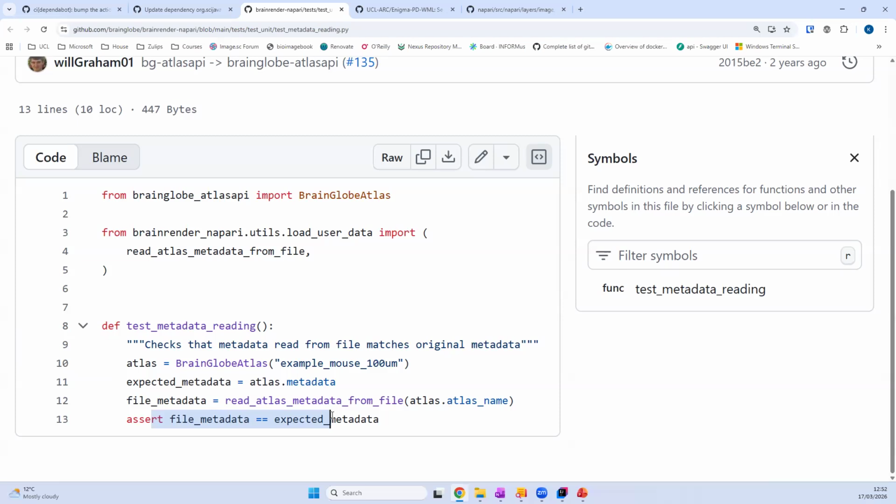All right, so here we have some automated tests. Ideally, you would add in a whole bunch that cover all of the important parts of it. But so far, I've only been running them locally. I'm running this on my computer, which is fine, it works, but it relies on me remembering to do that. So if I don't remember to do that, it's very possible for me to add code into Crosshair, BrainGlobe, whatever, and to break something and for it to remain broken.